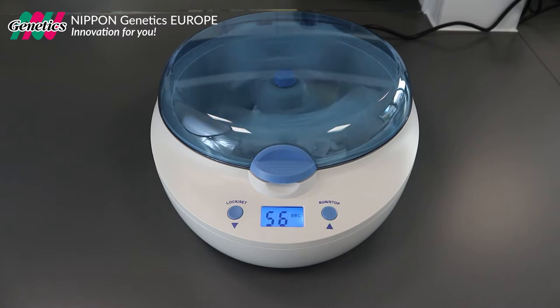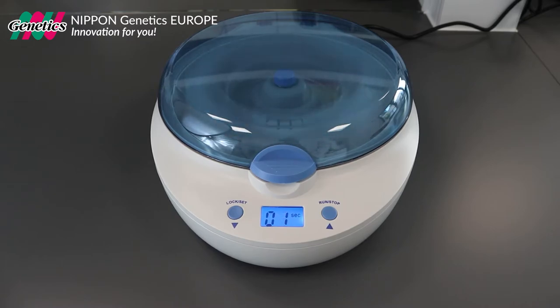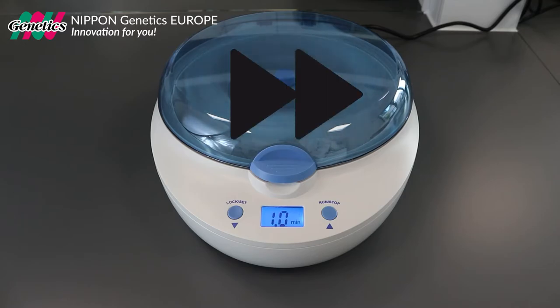The FasGene plate centrifuge is equipped with an extra silent rotor and extra tight lid sealing, making it the perfect device to support a quiet lab environment. It spins down your plates for all high-throughput applications.